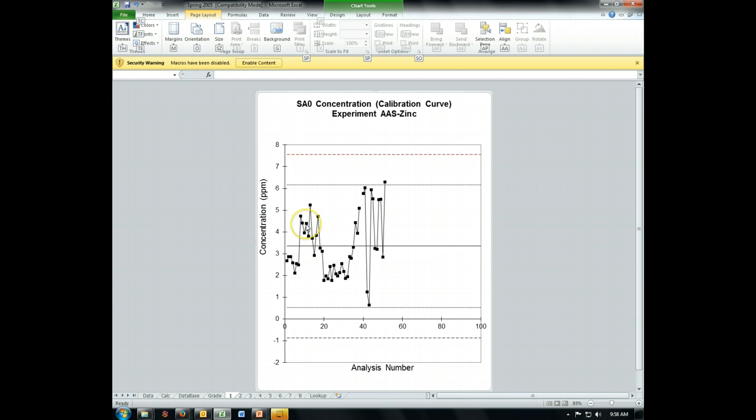Now the offset between these two, I wouldn't call that non-random, but I would say, hey, something probably just changed in one of our samples that we're bringing in or one of our standards. We should investigate. That happens again here and happens again here. There's a bit of a pattern here, and that might be cause for concern enough, once I'm familiar with what the data should look like for an assay, to say we need to shut down. These are the sort of things that we're watching for in our quality control spreadsheets.